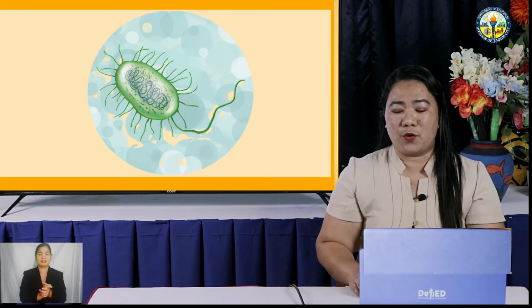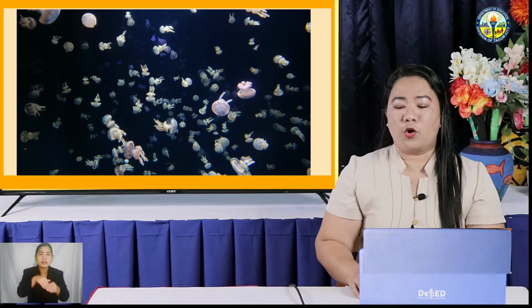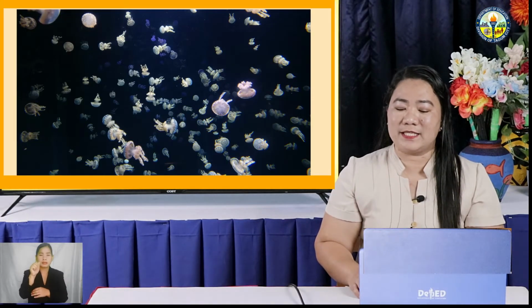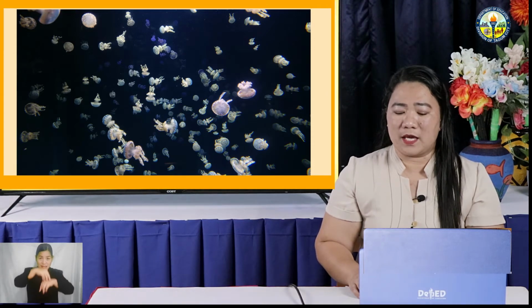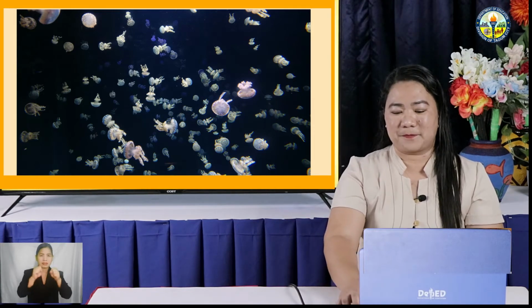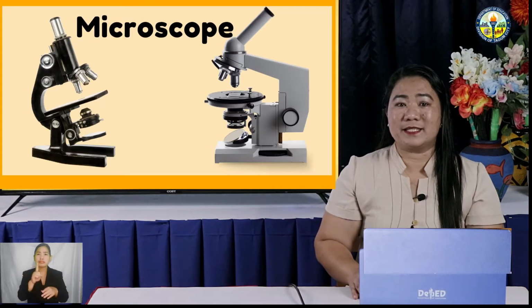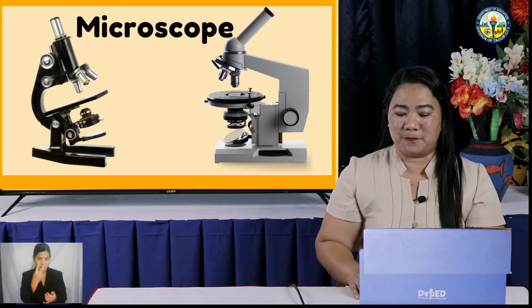How do scientists know what is inside a bacterium? Or what structures are found inside a dikya or a jellyfish? How do you think scientists are able to visualize these things? Let's take a closer look at this valuable tool called microscope.